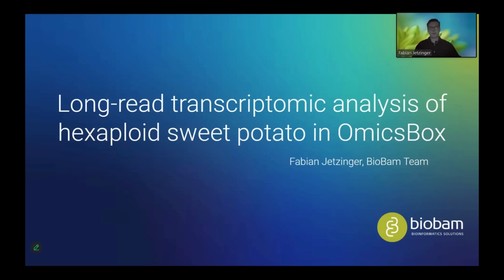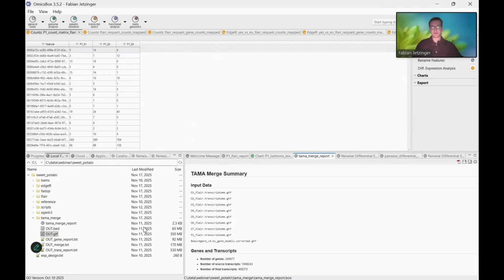So now, moving back into OmicsBox for the final few steps of our analysis. Now, of course, that we have lost a lot of potential novelty in our transcriptome, we could simply move on with the same quantification we already have, and simply erase all of the filtered out transcripts.